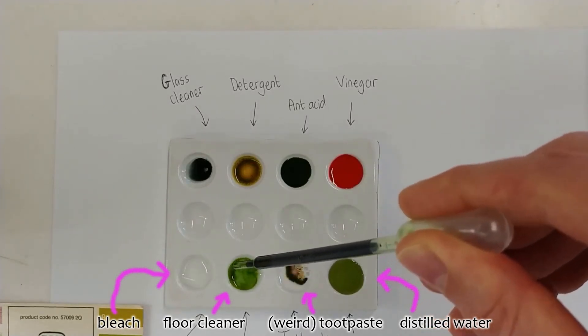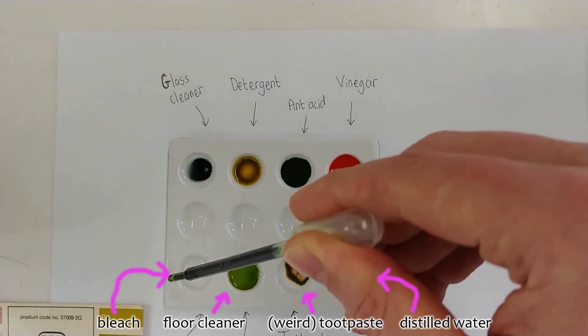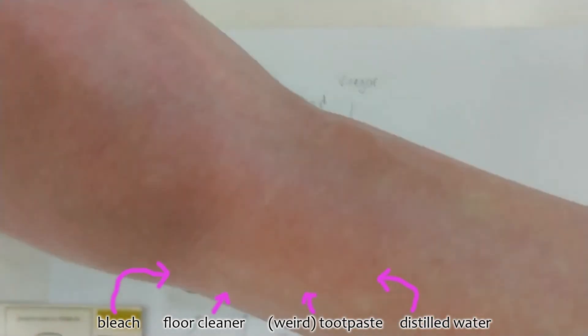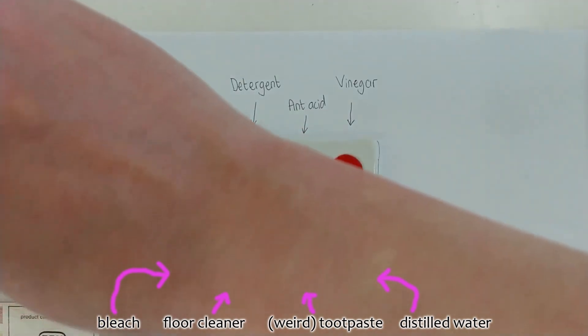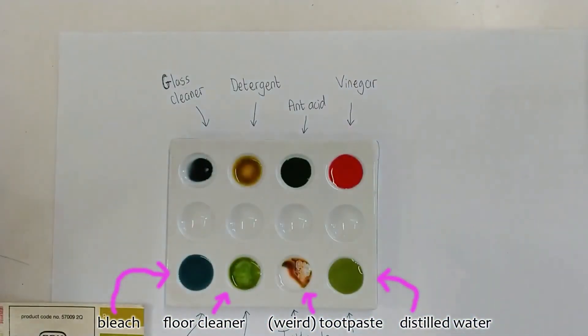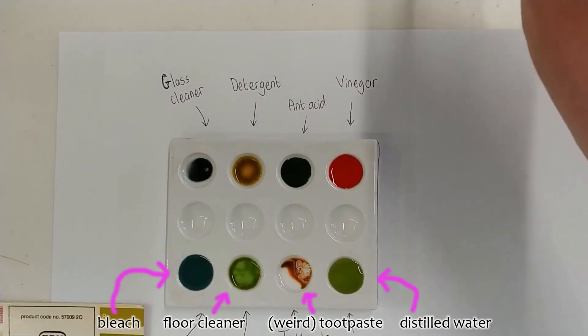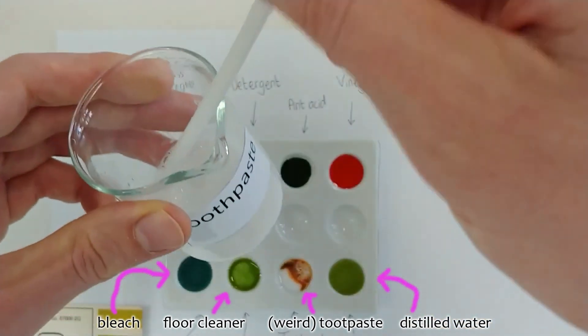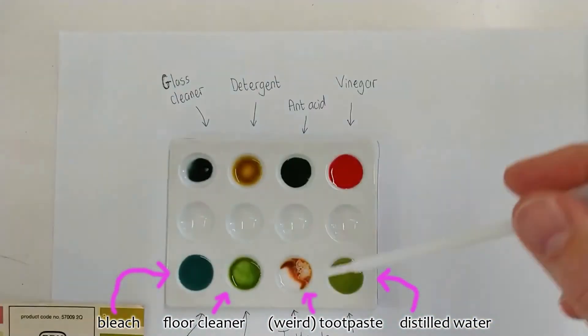As you can see, when it goes into the toothpaste, the color goes black initially, but look - it's going red. And then when it goes into the other two substances, you can see one of them just gives us a green solution and the other one is slightly blue.